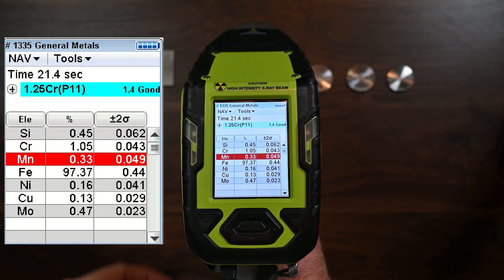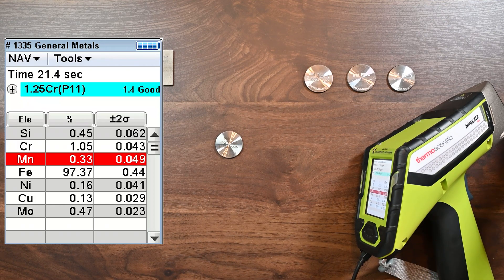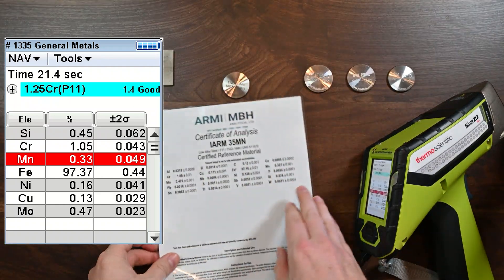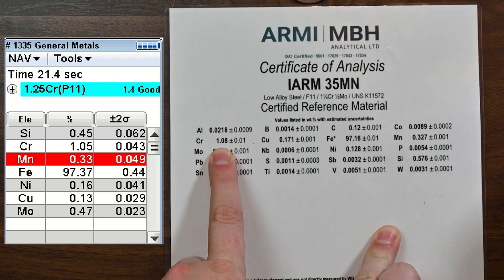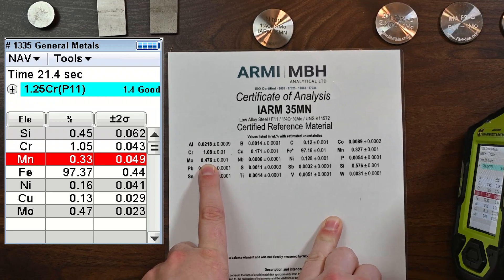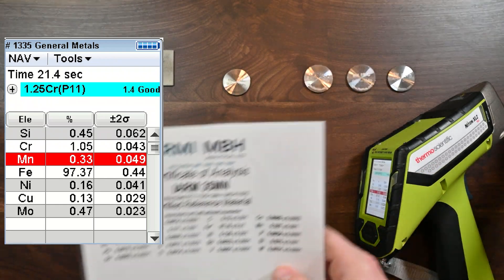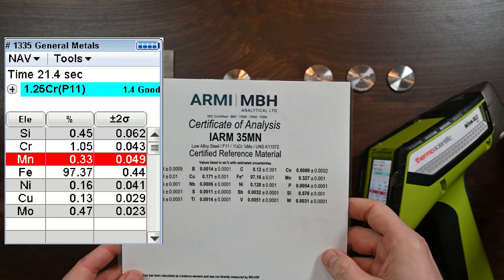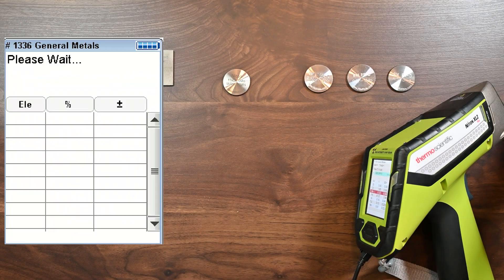And we're back. And so now we're going to take a look at the certificate of analysis. So you should be able to see my screen, the screen of the analyzer, but let's take a closer look at that alloy, right? So if we were to do something like this and look at a certificate, our chrome is at 1.08% and we read 1.05. That's within 0.03. That's really spot on. And that molly, 0.476, and we read 0.47. I mean, this analyzer is doing a great job of nailing the chemistry. So this is a certificate of analysis. This is a certified reference material. And that's kind of how you know your analyzer is working properly. So if you need things like this, you can find them on alloygeek.com. But let's keep going here and take a look at another sample.